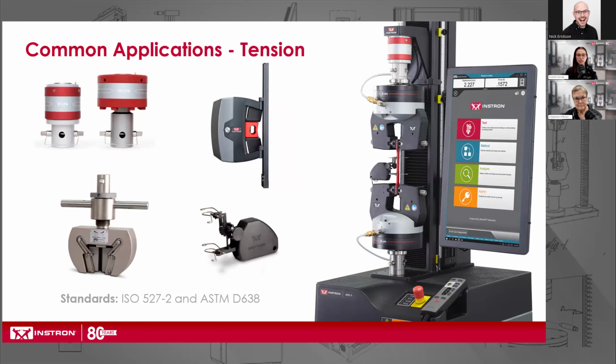Looking at some tension tests, what are the most common accessories that we should be using? For all test types, a load cell is going to be required to gather the force readings of the material. Like we mentioned, typically plastics testing will require either a 5 or 10 kilonewton load cell. When testing in tension, side action grips or wedge action grips will be able to hold the material without any slippage. It's important to have all of your accessories rated to a force capacity that's higher than your material strength to avoid damaging any of your accessories.